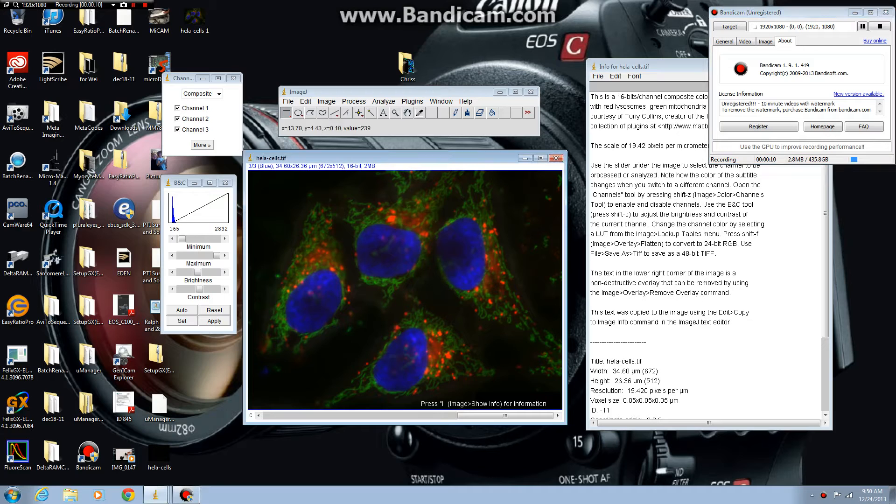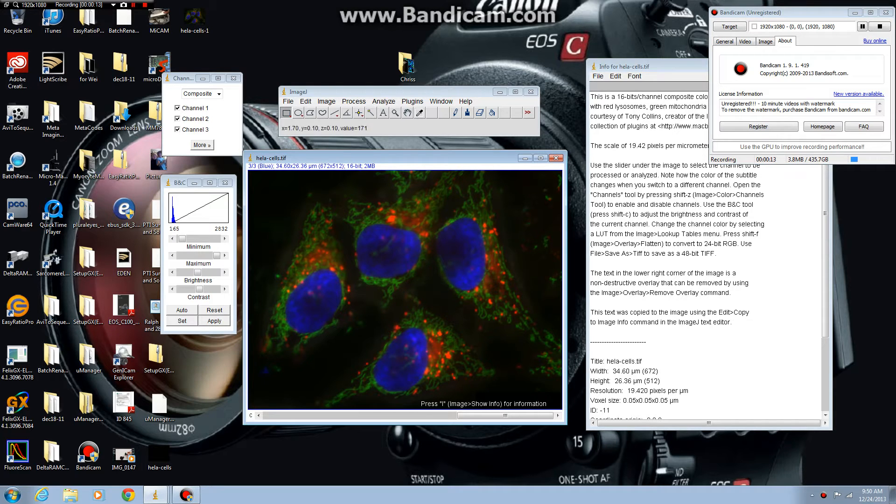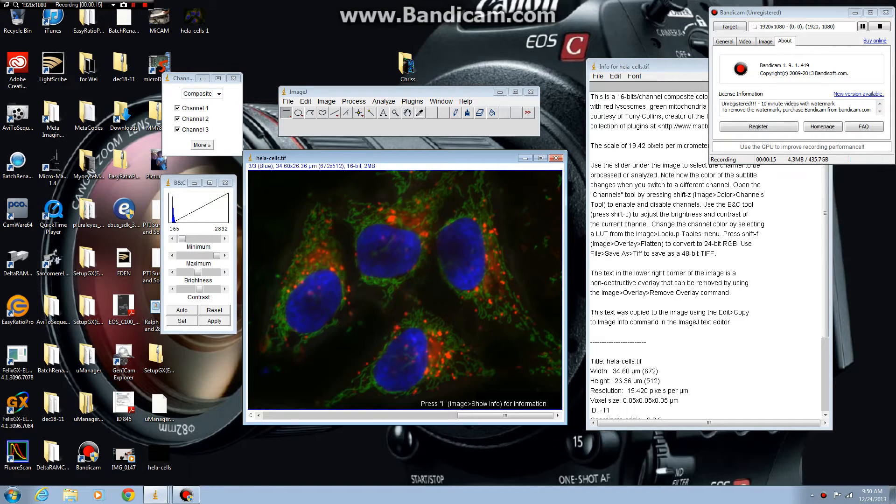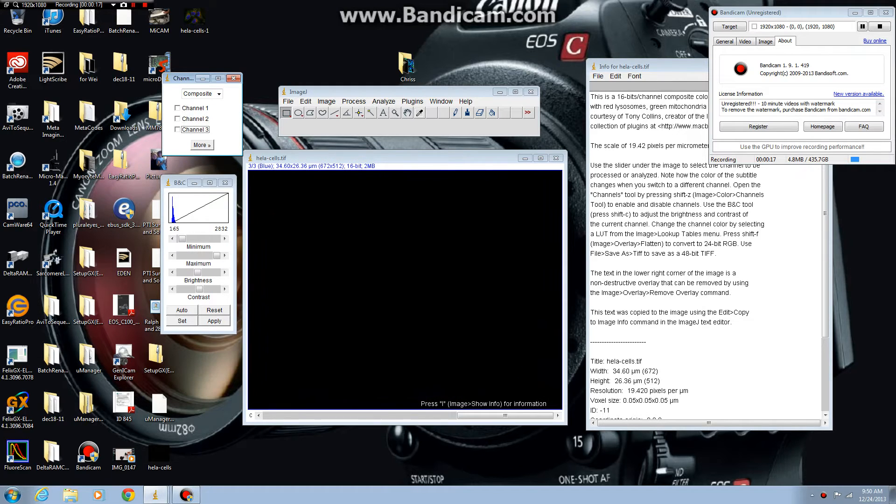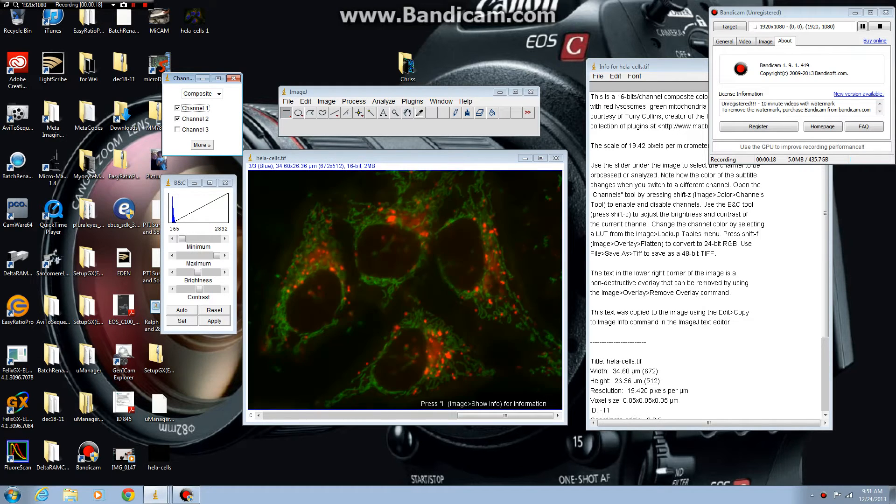The image that you see in this window is a three color channel image, 16-bit. You can see you can turn on and off color channels.